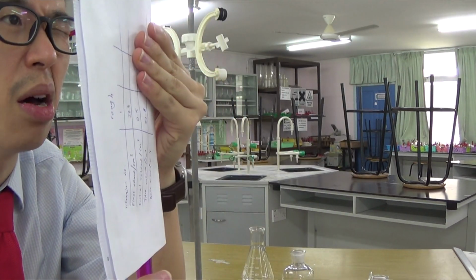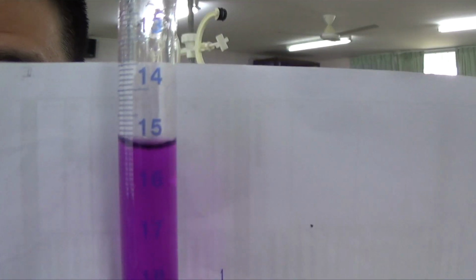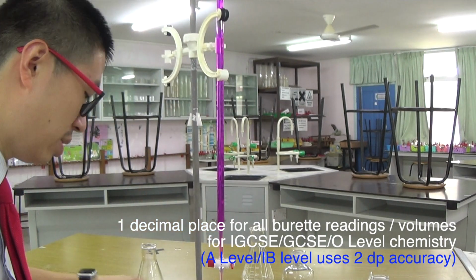So you need to read above the meniscus, and reading above the meniscus here gives me 15.0 cm cube. So this is my initial volume, and I'm ready to do my first exact titration.